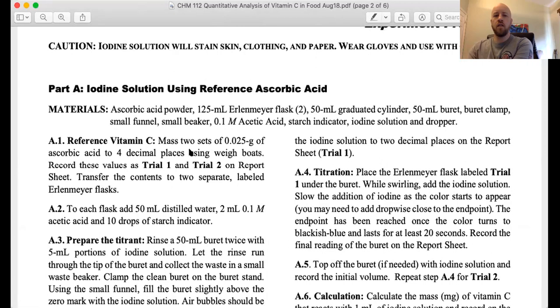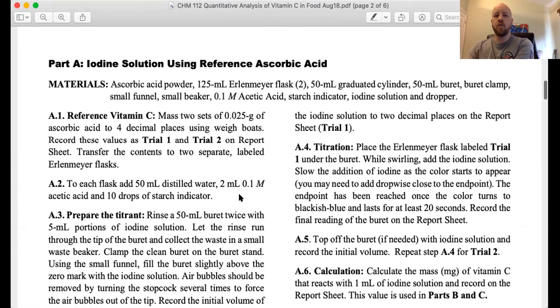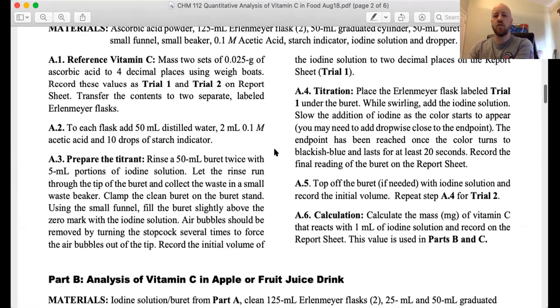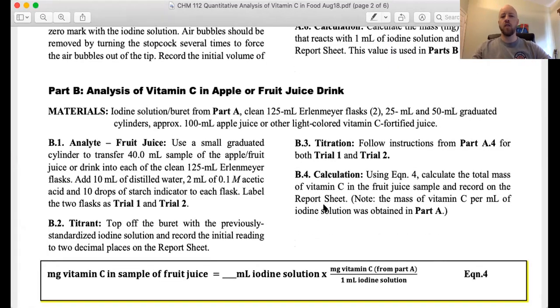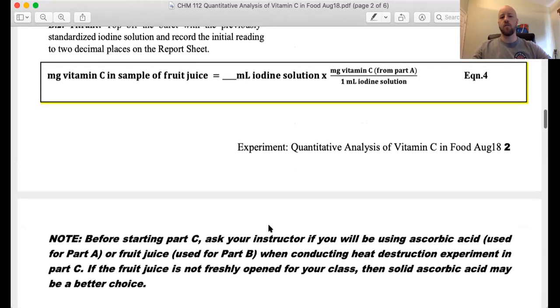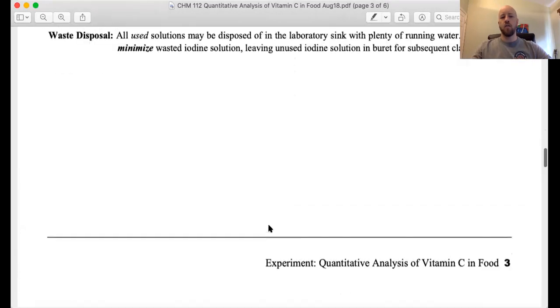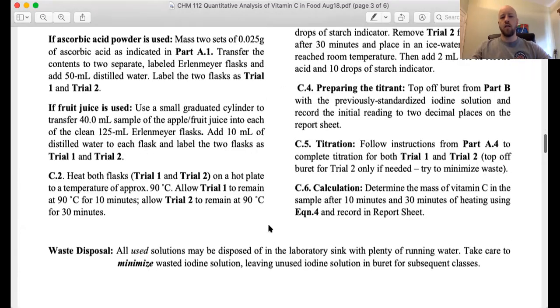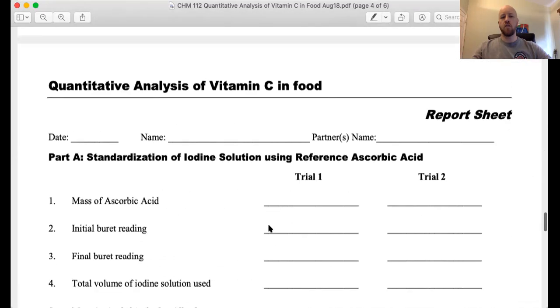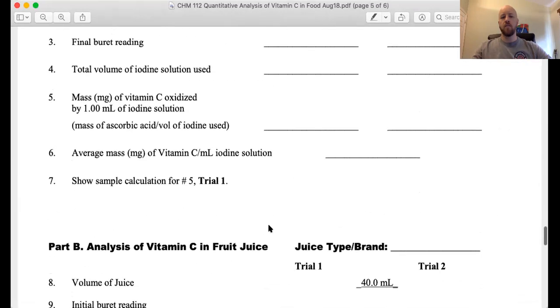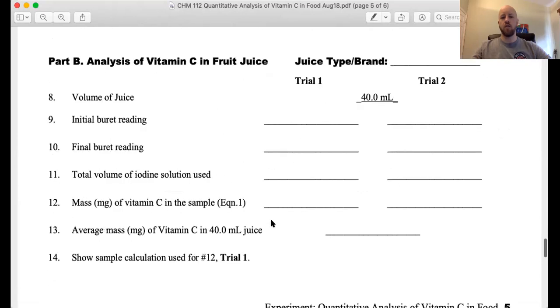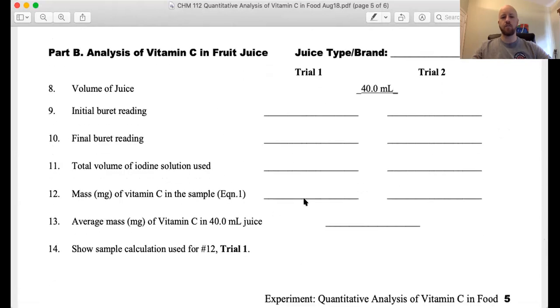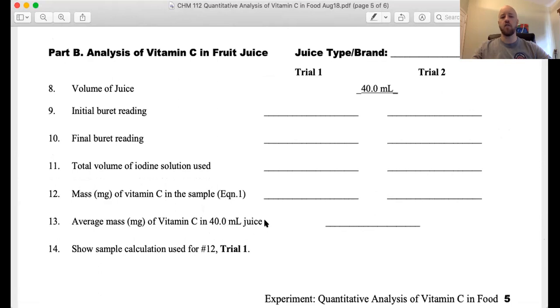So in this experiment when we do this in the lab, we start out with a standard ascorbic acid sample. So this is usually a two part experiment. The standard ascorbic acid sample is titrated first, and then we titrate against the fruit juice. In the simulator that we're going to use, there's only two parts. Most of the data here is going to be exactly the same in the simulator. The simulator takes this one more spot because they're really interested in a different value. If you're answering the value from the simulator, it's for 10 milliliters of the juice, you got to adjust a little bit at the end.